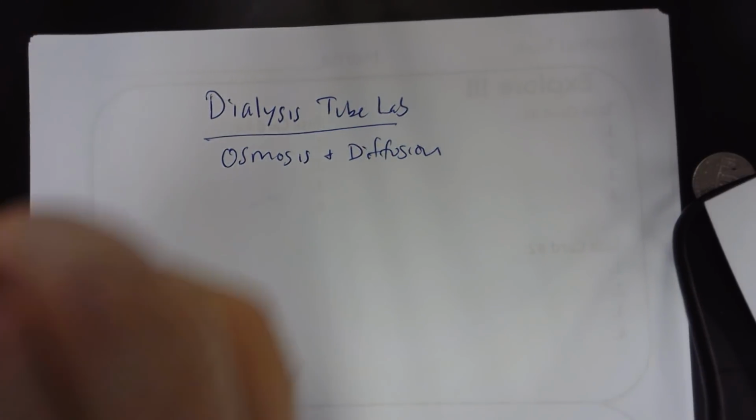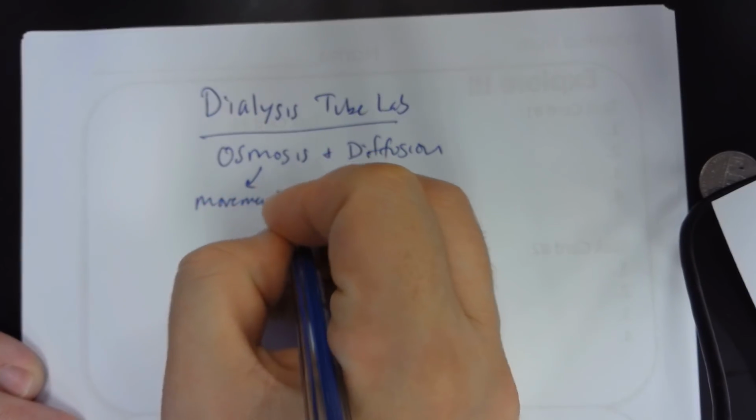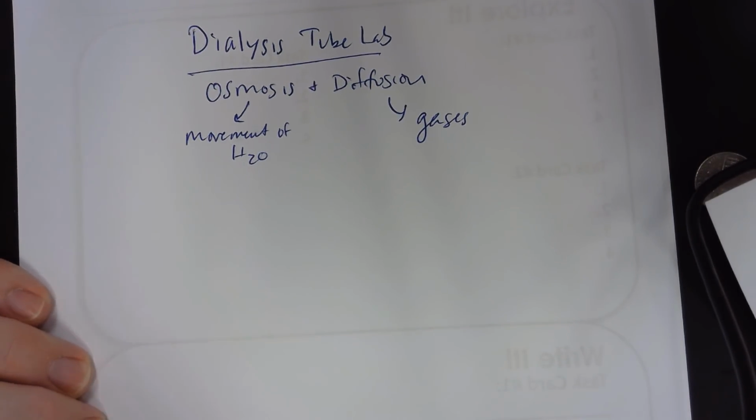Taking a look at osmosis and diffusion, if you remember back from our notes, osmosis was the movement of water, and diffusion is movement of gases and particles. So let's take a look at the actual experiment.